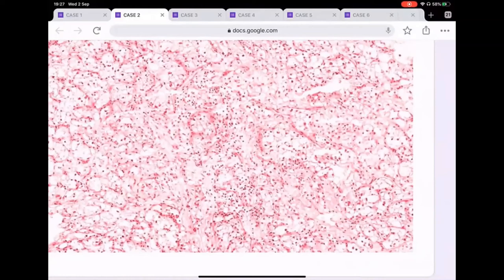But the next question will be, the surgeon is asking you, okay, what should we do? Right? So again, now you know my answer, okay? Can one of you just predict what my answer is going to be, please? Exactly, that's what it is. Yes, this is a malignant neoplasm. The next step in the operation is up to them to decide. It is not going to be adrenal because this is an intraparenchymal nodule. He said that this is a nodule in the kidney.